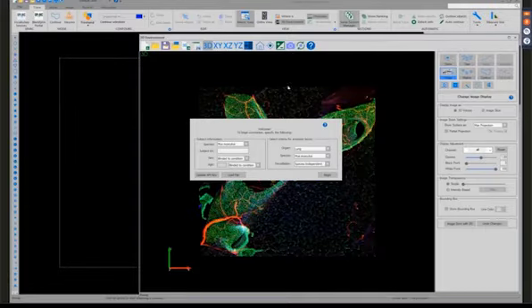This sample behind me, the image behind this dialog, is a 10x confocal image of a section of mouse lung from the Thomas Taylor Clarke lab at the University of South Florida. So to populate my segmentation with file-level metadata, I would choose the species, mouse, input my subject ID, my sex, and my age of the sample.